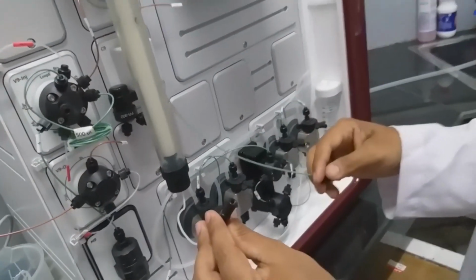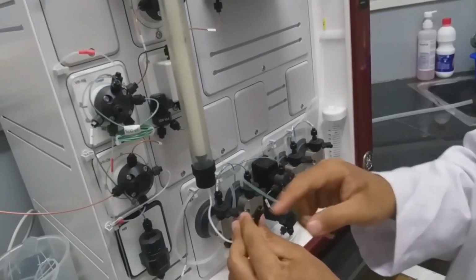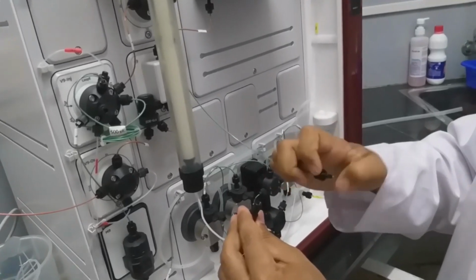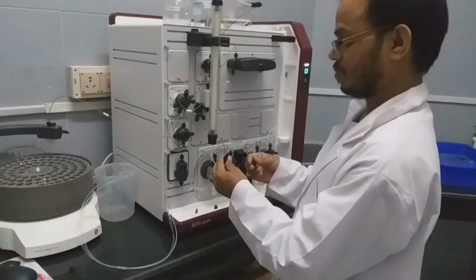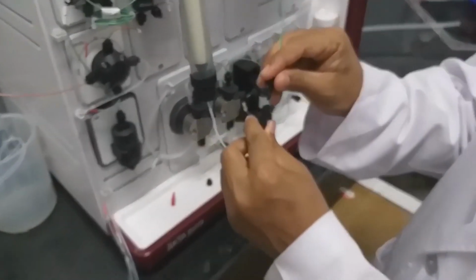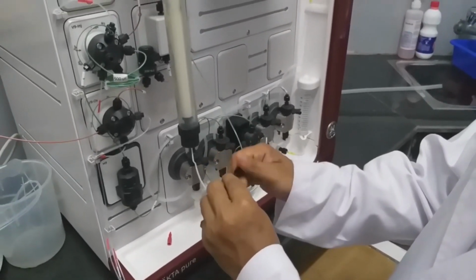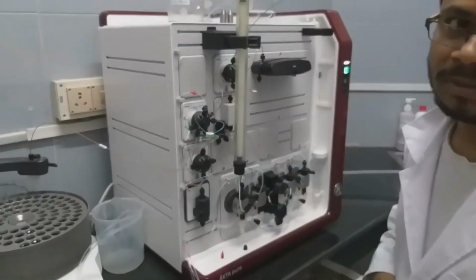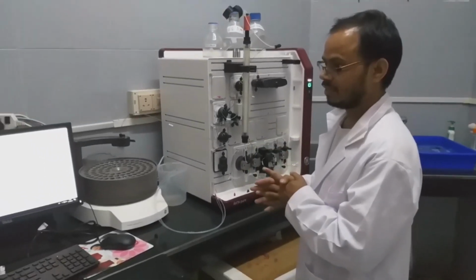Once you see complete fill up of this loop or this knob, you can directly insert the lower portion. Once you see the buffer filling in, you just have to connect with the downward portion. So now the column is connected to the system and you need not touch anything.